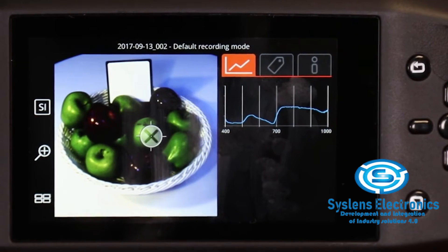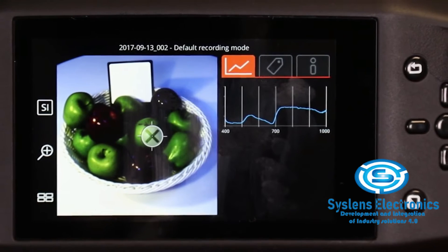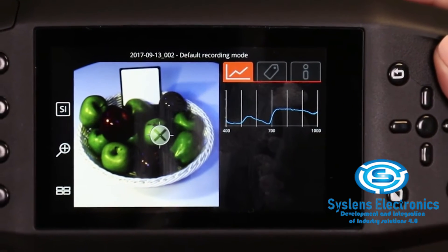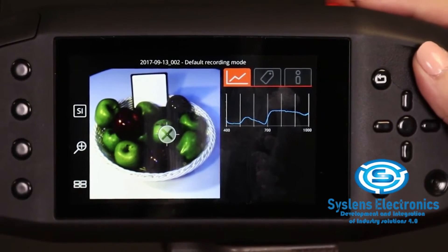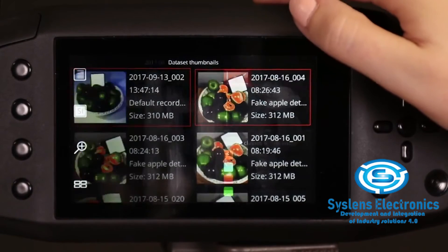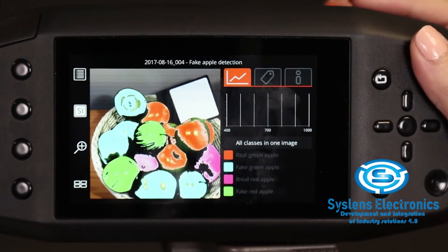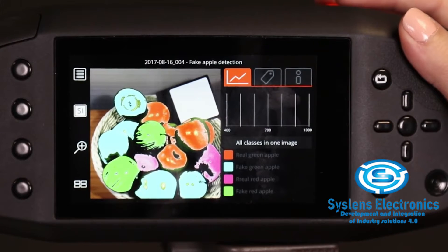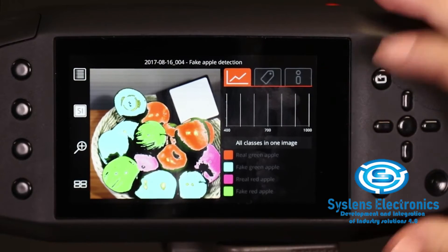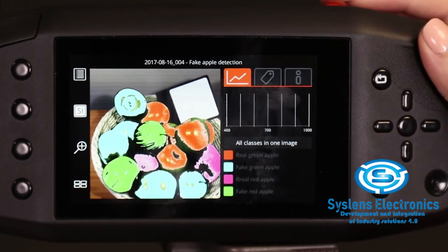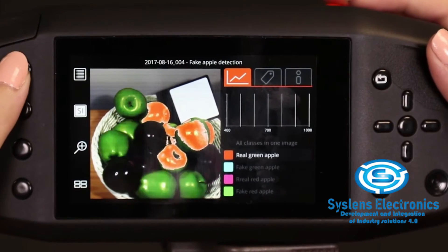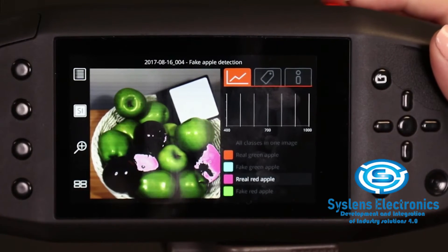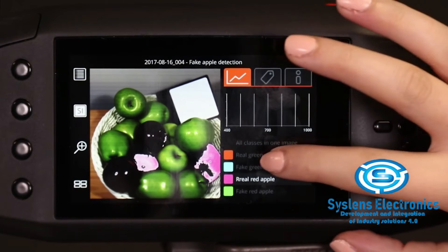This view has some additional functions if you have recorded your data either with an application, or by using the automatic screening mode. Here we can see data recorded with an application that has four classes, and an additional option to view all of the classes in one image. You can change the classes by pressing custom 1, or by choosing the class directly on the touch screen.